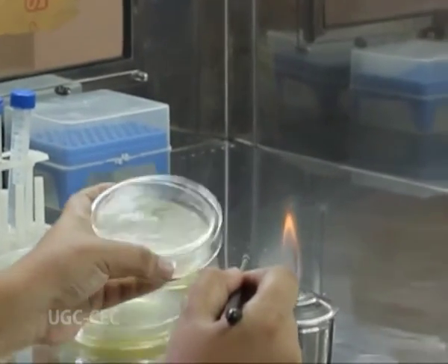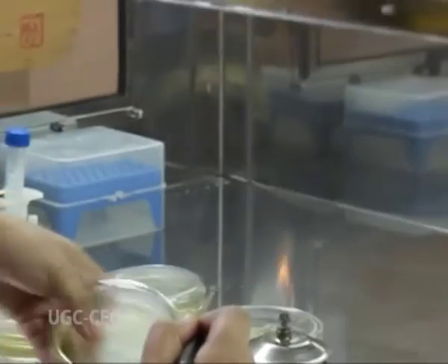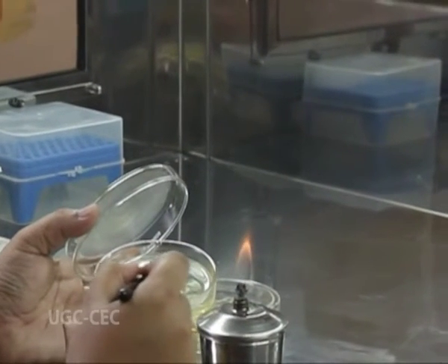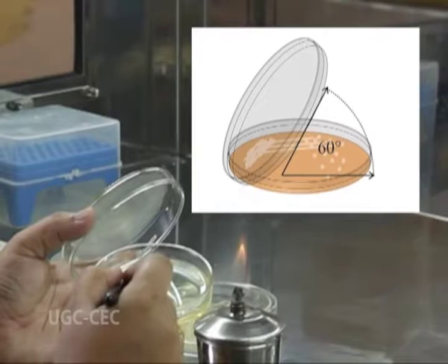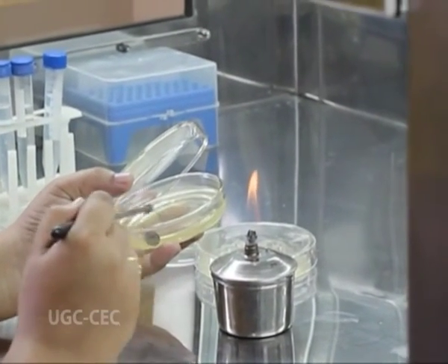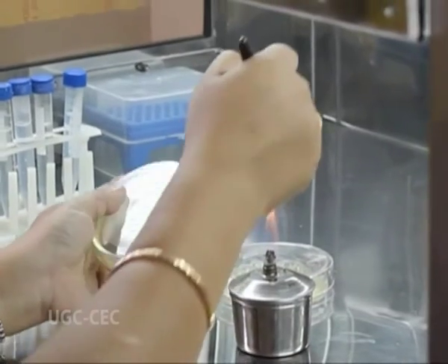the tube is taken. Then, the petri plate cover is lifted by the use of the left hand, holding at a 60-degree angle. The inoculum is placed on the agar surface and streaked from side to side in parallel lines across the surface of the area.